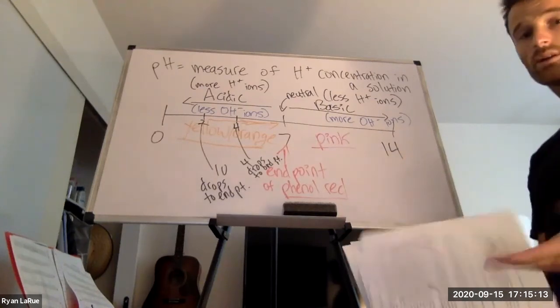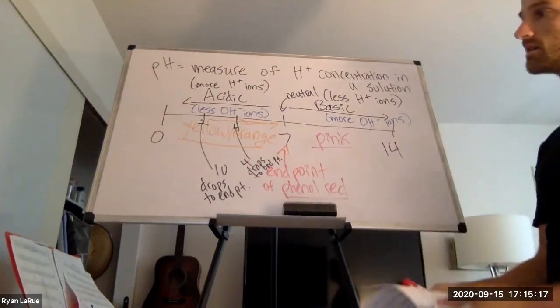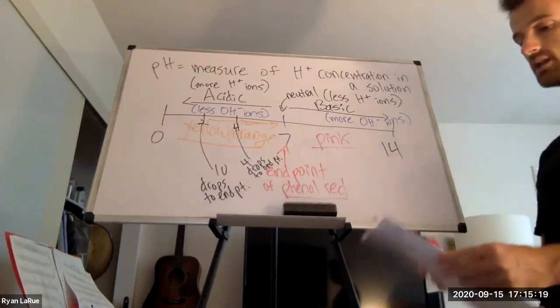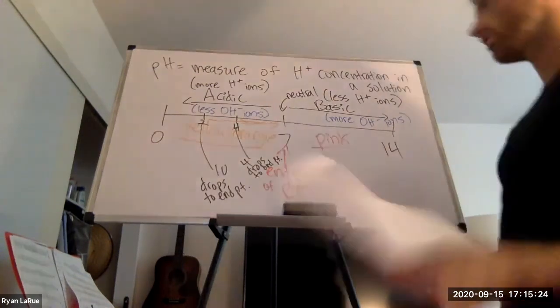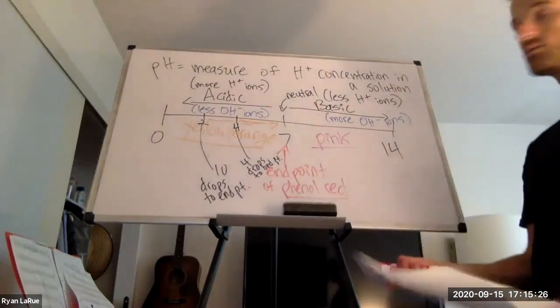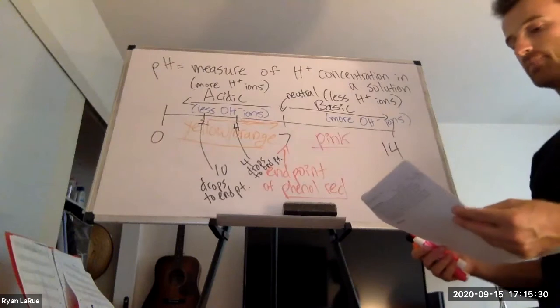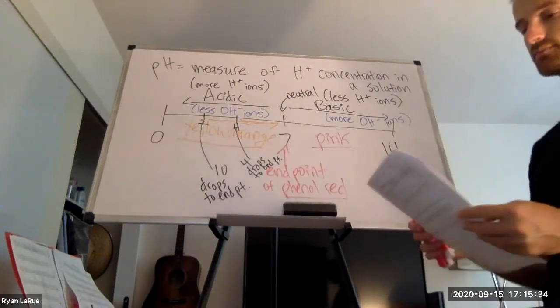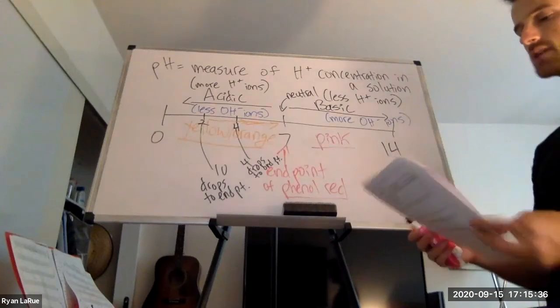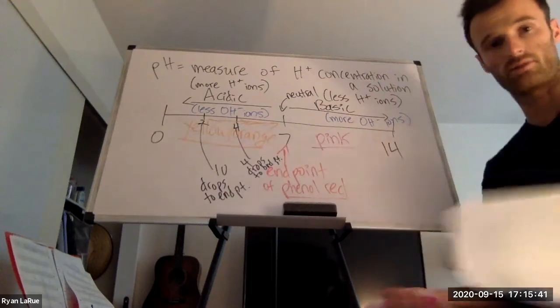So this is really what you're going to be doing with a few acids first, watching Stacy's video and determining how many drops of base it will take for different acids to determine the pH. Then in exercise 2 of the lab, you're actually going to be determining the pH for different body fluids.